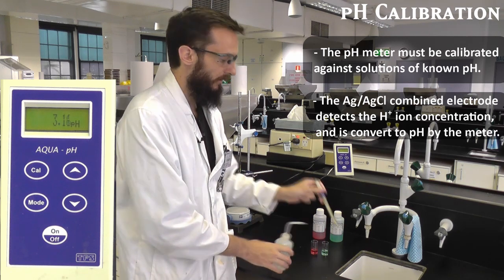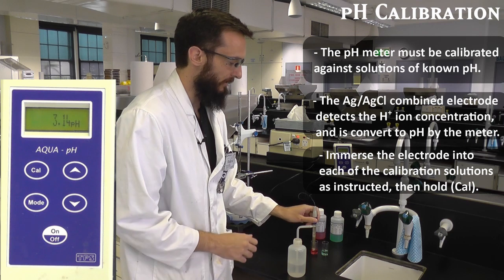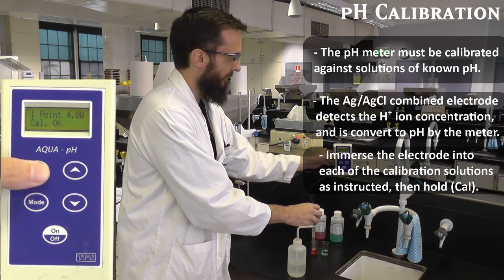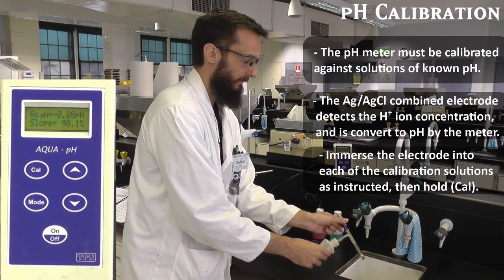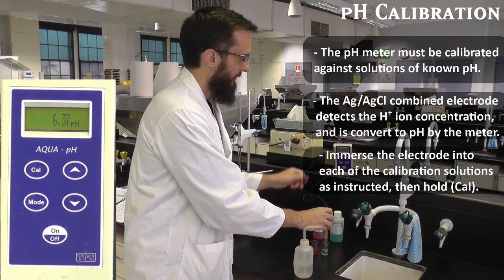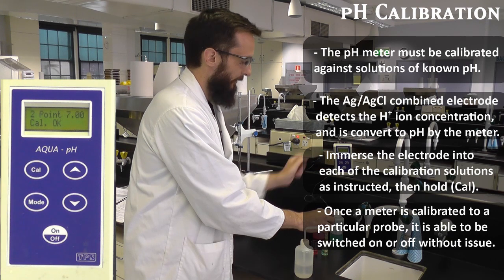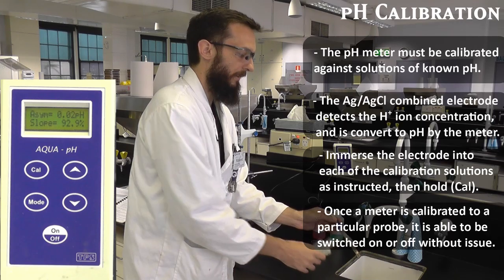So what I'll do is I'll give the probe a quick wash with some DI water, stick it into my first calibration solution, wait until that reading steadies, then hold cal for just a moment until it beeps and tells me it's okay. Then I'll rinse the probe off, put it into my other pH solution, and this should be about pH 7 this time. Hit cal again and tell the probe that is exactly pH 7 in that solution. So now with a 2-point calibration, we're ready to go for our experiment.